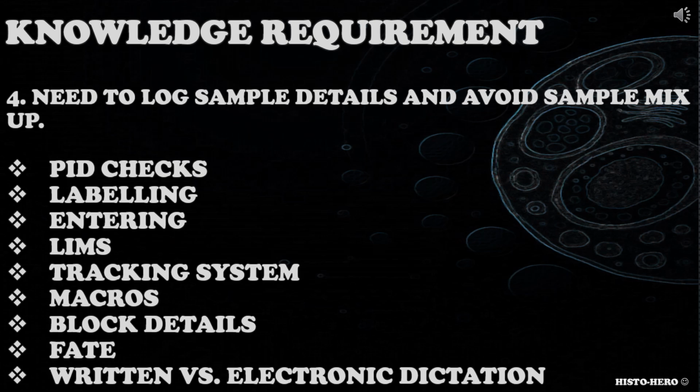When addressing this knowledge requirement, candidates should consider PID checks during specimen reception, labeling of samples, LIMS systems used in your lab, tracking systems used in your lab such as Vantage, macroscopic description of samples, details of blocks taken, sample after dissection and so on.